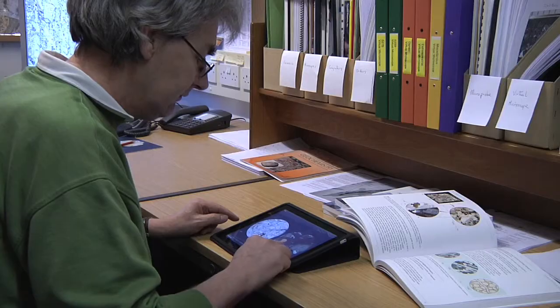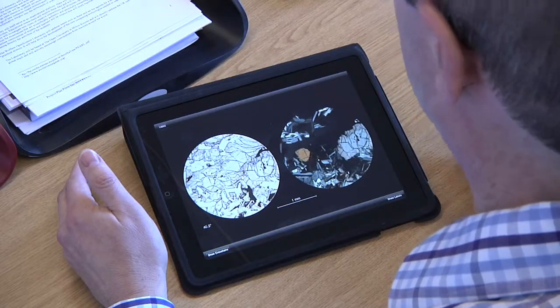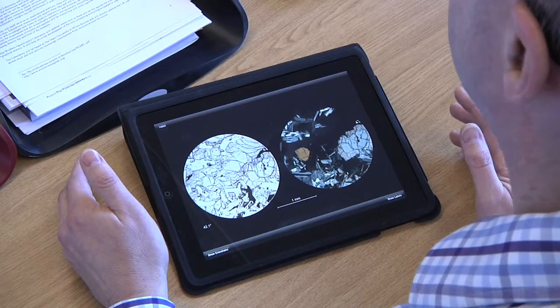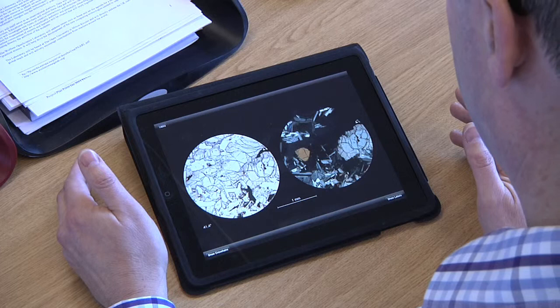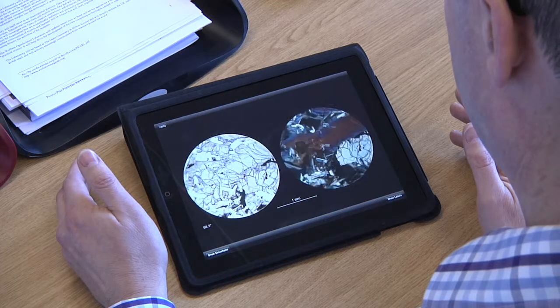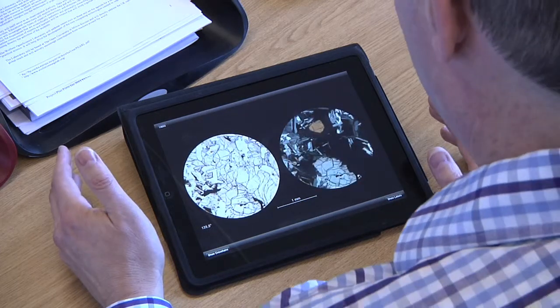Now you can see just there — the pyroxene has gone into extinction. So you're saying the yellow crystal's olivine, but how do I know it's not a pyroxene?